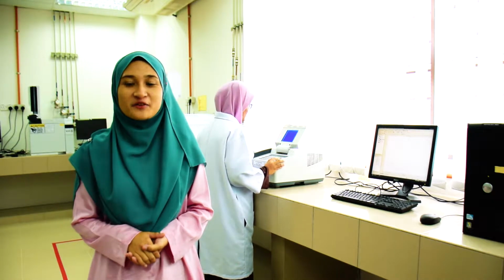UV-vis is the measurement of attenuation of a beam of light after it passes through a sample or after reflection from a sample surface. It is used to measure the intensity of light passing through a sample and compare it to the intensity of light before it passes through the sample.